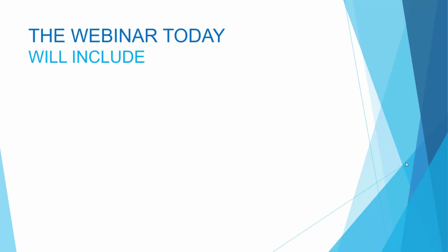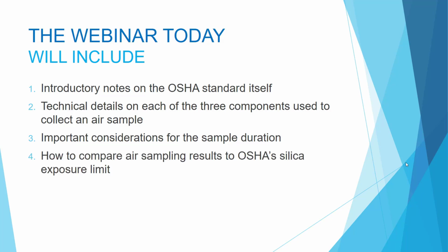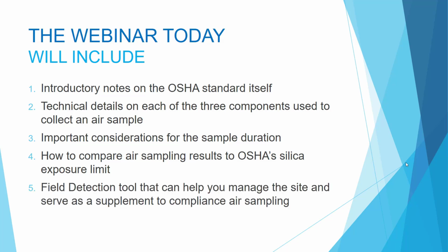The webinar today will include introductory notes on the OSHA standard itself, technical details on each of the 3 components used to collect an air sample, important considerations for the sample duration, how to compare air sampling results to OSHA's silica exposure limit, and a field detection tool that can help you manage the site and serve as a supplement to compliance air sampling.